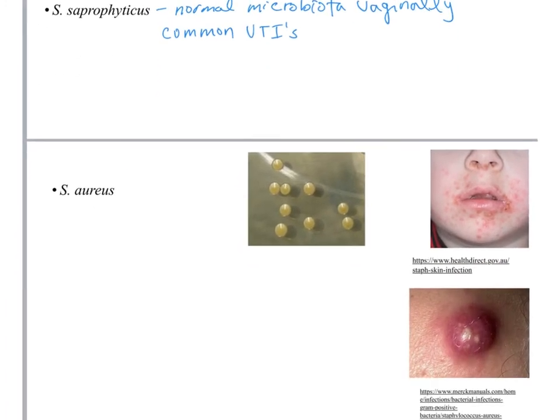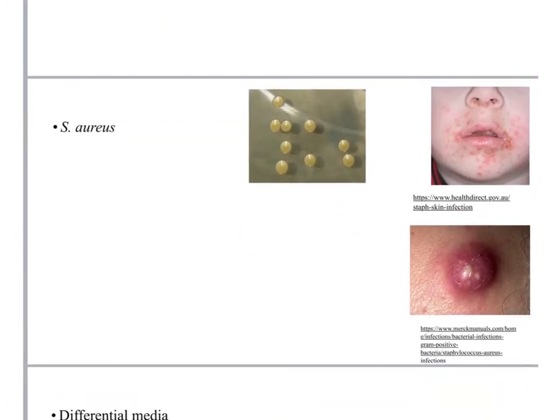The real nasty one in this group of staph that we'll be working with is Staph aureus. And again, remember, this is a strain that's supposed to be benign. It's not supposed to cause any of the things that I'm going to talk about right now. Aureus is Greek for gold, so commonly the colonies have a goldish, yellowish tinge. The strain that we work with is more of a creamy color. We try not to make that obvious, so for your unknown, you don't look at it and say, oh, I don't need to do anything, I know I have Staph aureus.